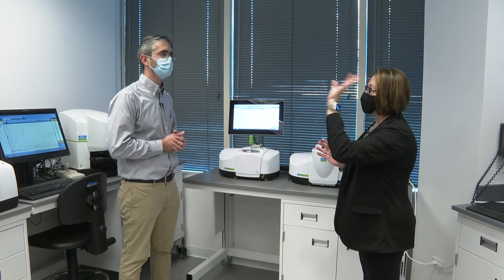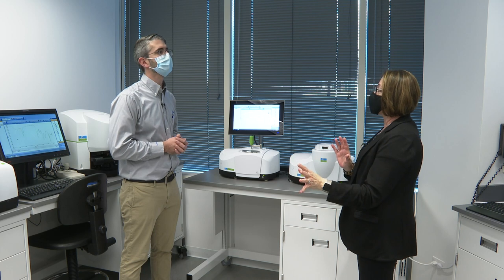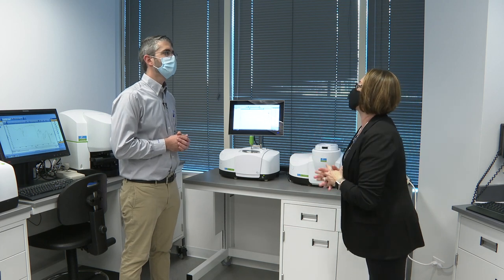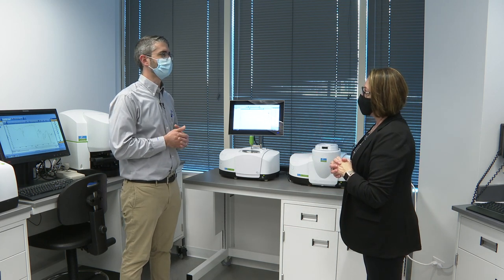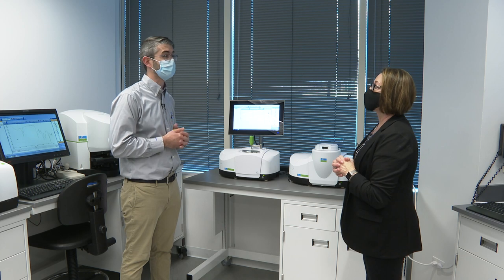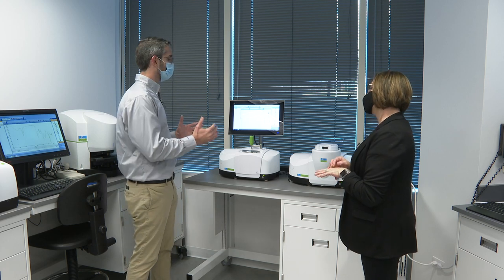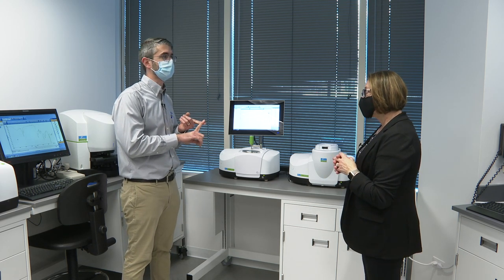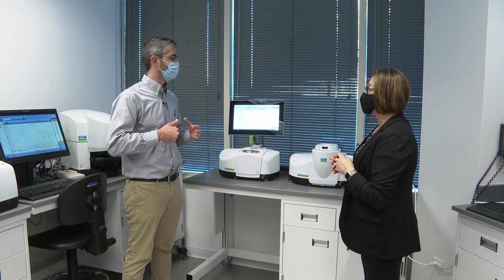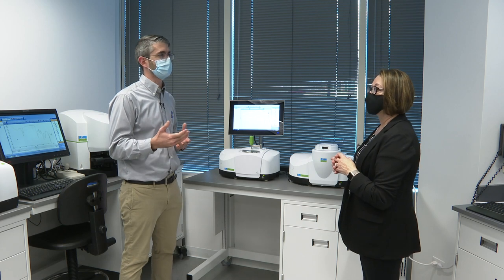When we were in the chromatography lab, Alan was talking about using the GC mass spec for hand sanitizer. Is this a quicker analysis and does it complement it? The GC instrumentation is very well suited to analysis of trace impurities — looking for contaminants present at very low concentrations in the raw ingredients or the finished formulation. Infrared is fantastic as a screening tool, making sure that you have the proper material, especially in settings where customers work with very large volumes of sample and need a quick turnaround to ensure there hasn't been a mix-up in shipping.